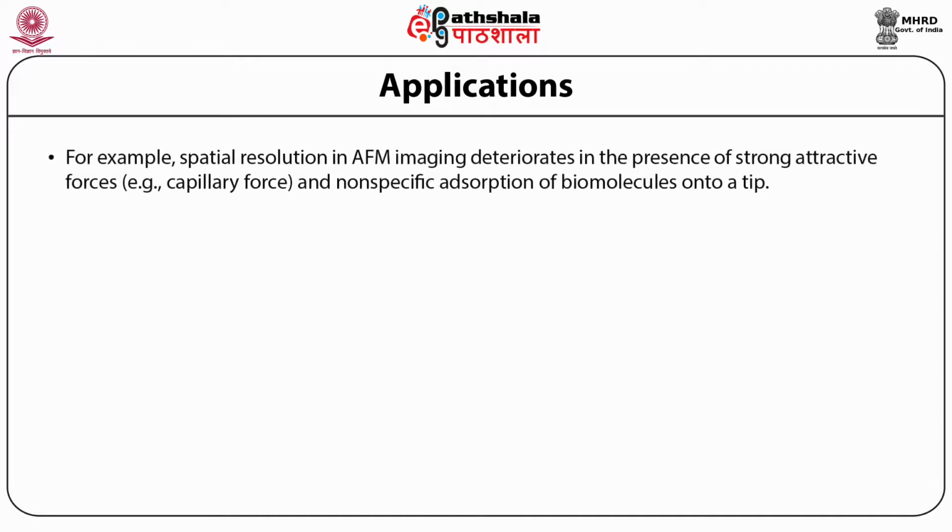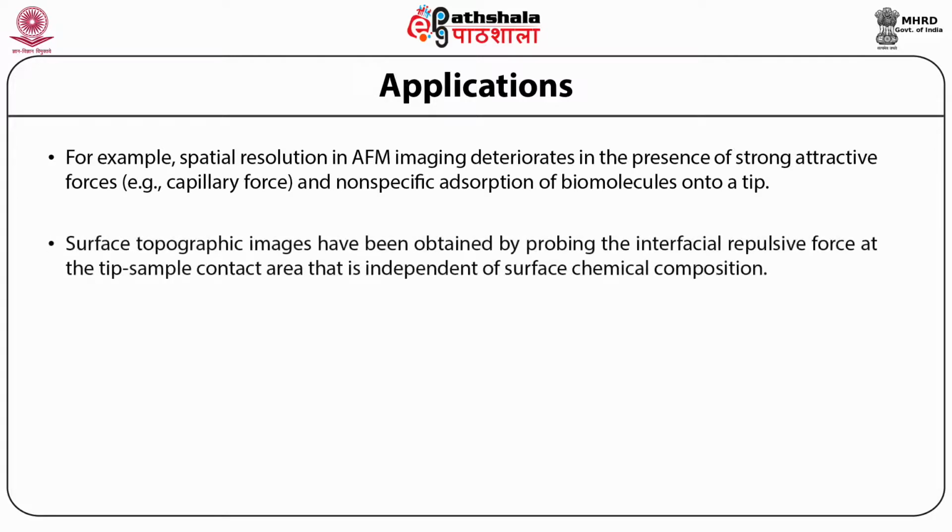For example, spatial resolution in AFM imaging deteriorates in the presence of strong attractive force and nonspecific adsorption of biomolecules onto a tip. Surface topographic images have been obtained by probing the interfacial repulsive force at the tip-sample contact area that is independent of surface chemical composition.